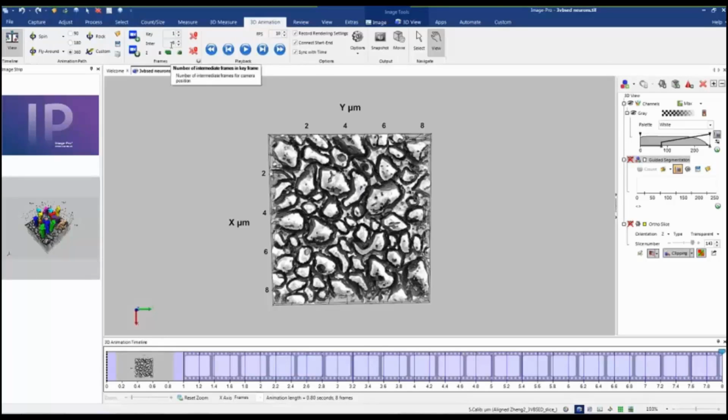So to the next transition, every 8 frames would be added between 2 keyframes. The number can be changed, and it can be changed globally. I'll show it later. But the default 8 frames could be good to create initial animation.